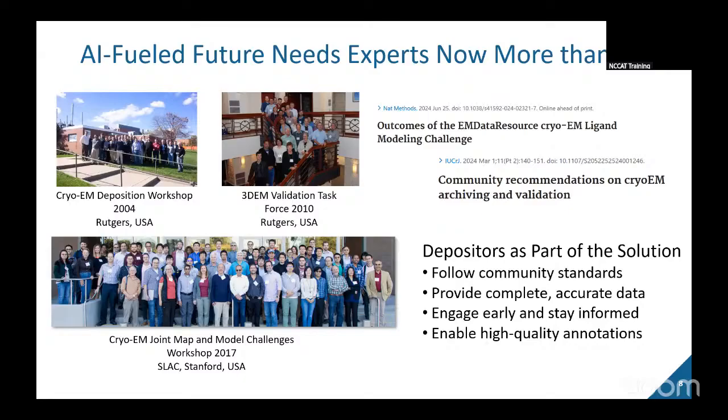And looking ahead, we expect to see more and more from data science and machine learning experts as we are in this new time where we see a lot going on with AI and automation. And already we see with projects like Cryo-ET Data Portal some of these interesting things, where they give standardized, validated Cryo-ET data sets for training and benchmarking purposes.